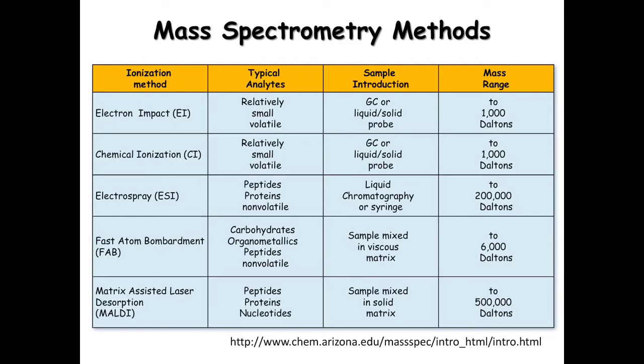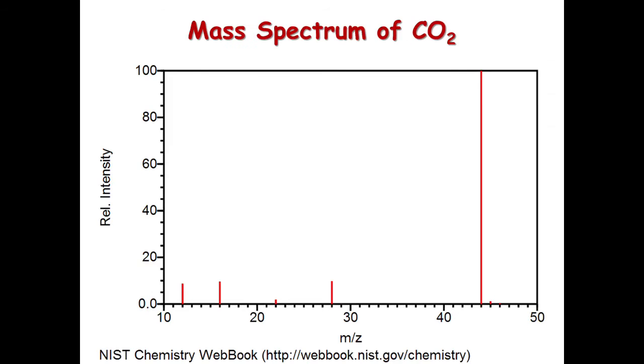When you see in that chart GC, that is gas chromatograph. Everything else you read through and see it, but as the molecules get bigger, there has to be different devices to use in order to pick up the mass range.